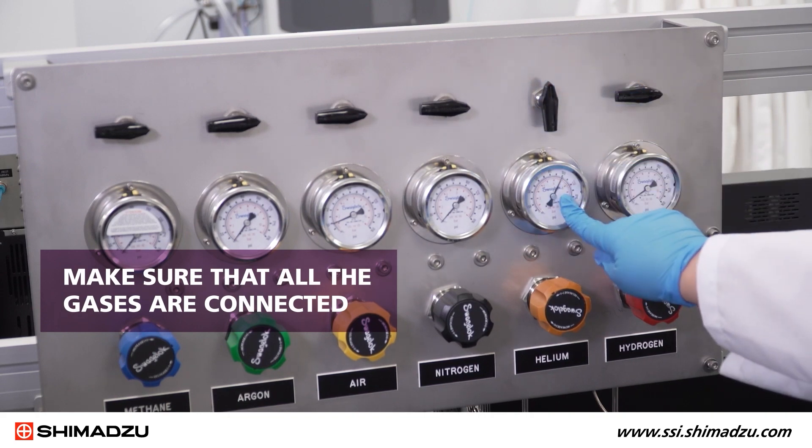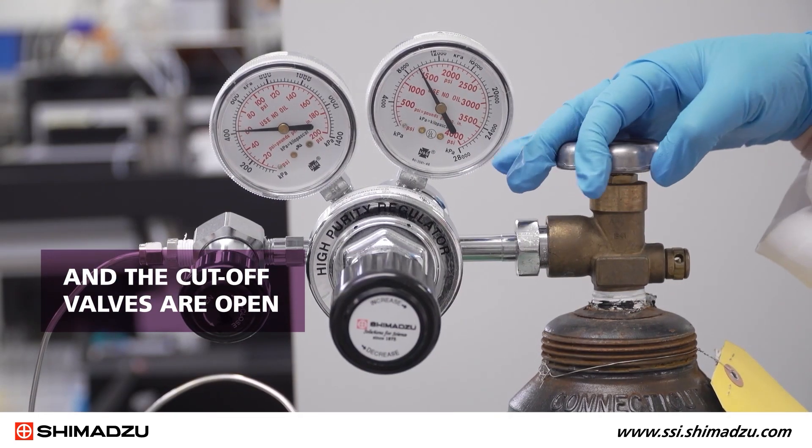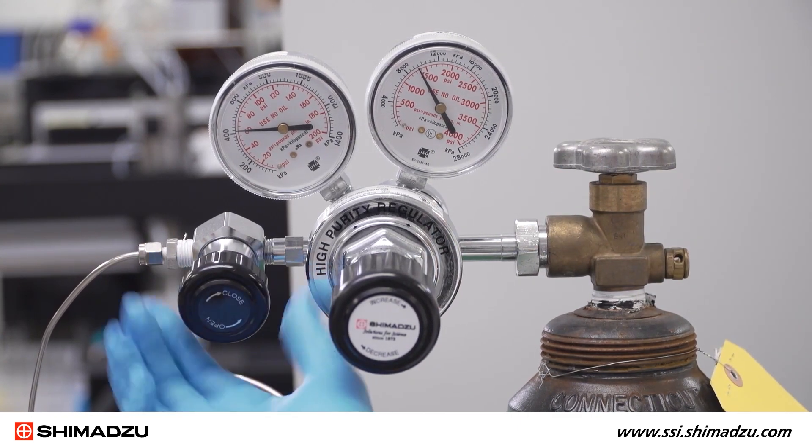Make sure that all the gases are connected, the regulators are set correctly, and the cut-off valves are open. Consult the GC site prep document for necessary gas purity and supply pressure.